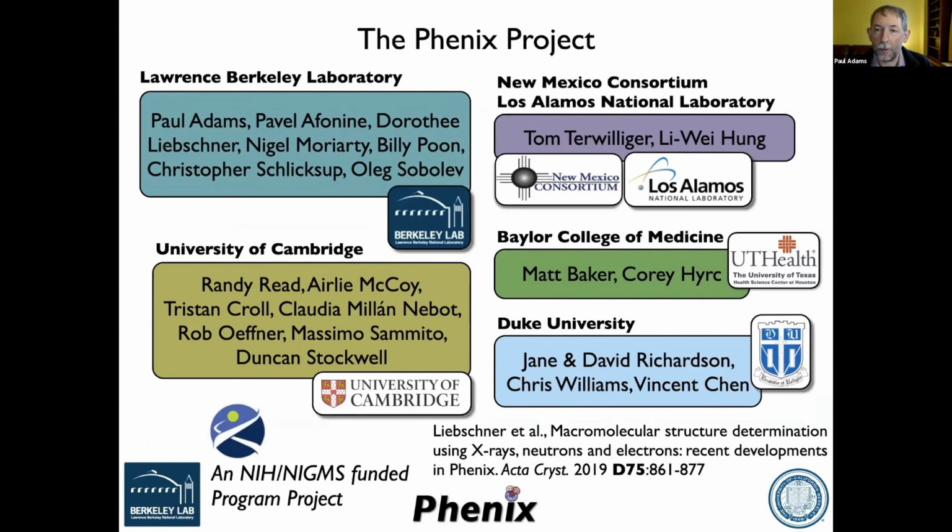Yeah, and we would advocate pretty much the same for crystallographic refinement as well. Maybe not in the very early stages when the model has serious errors and you don't want to get the wrong things interacting with each other, but certainly later on in refinement. They do actually hurt going over barriers in the refinement. But once you feel the model is in pretty good shape, then definitely it's a good thing to include in both kinds of domains.